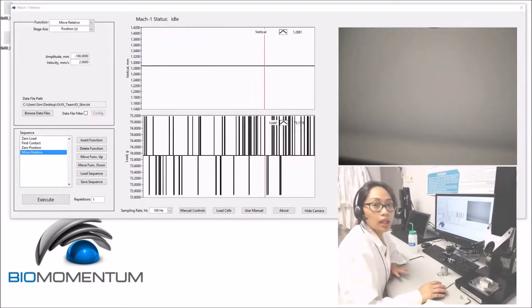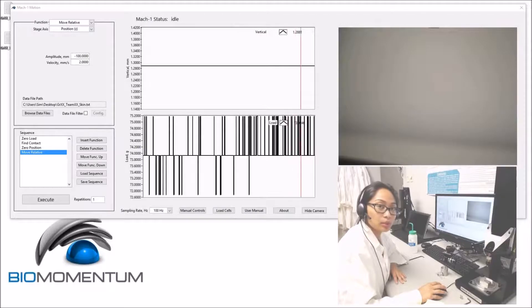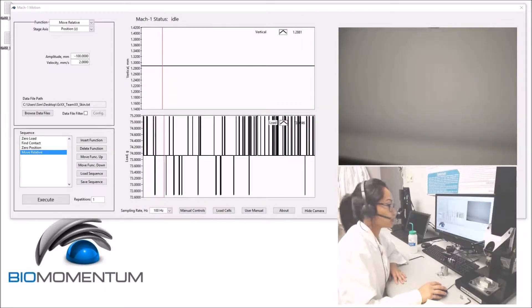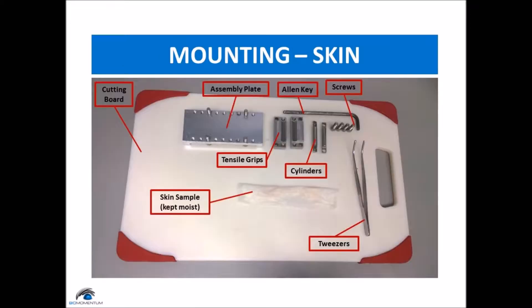Now let's mount the skin sample on the tensile grips. The mounting of the skin sample for tensile test requires a cutting board, the skin sample which needs to be kept moist, an assembly plate, tensile grips, cylinders, screws, an Allen key, and tweezers.